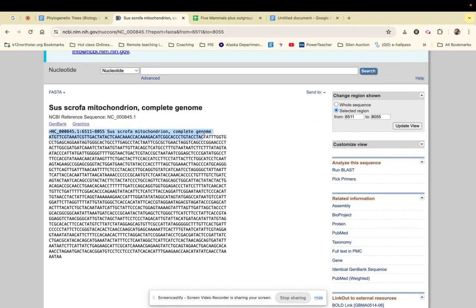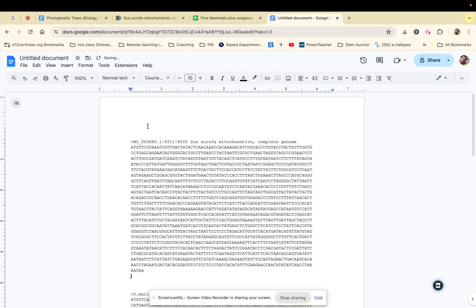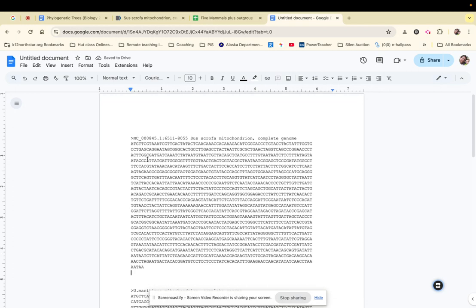It includes a caret with a name, and then there's a paragraph return, and then just a whole bunch of letters beyond that. And we don't have to read it or write it down or anything like that. We can just copy it. In this case, we're going to copy it over to a blank document. This is just a purely blank document. It shouldn't have anything besides paragraph returns and spaces. So I can paste it in there. Boom. Okay, now I need to adjust the name.